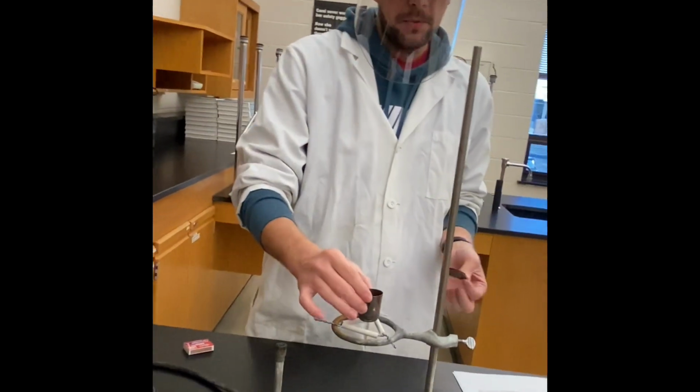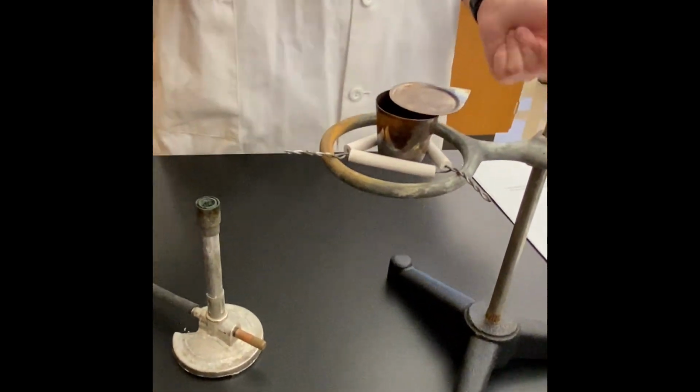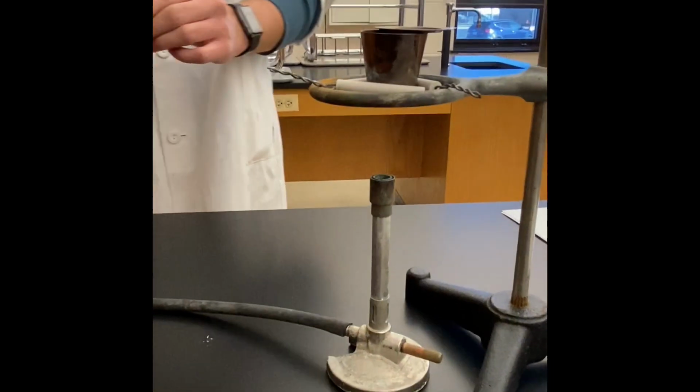I'm going to take the crucible and put it in this clay triangle on a ring stand here and leave the lid a little bit off so that the oxygen can get in. Right, and we will light our Bunsen burner to cause that same reaction.